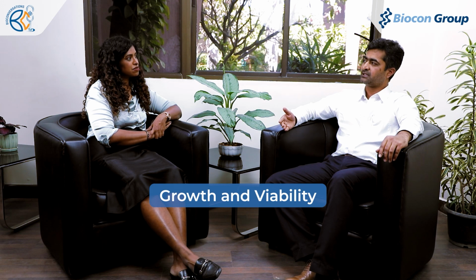And after that, since we have to grow a sufficient number of cells, during that time, growth and viability is something which we'll have to monitor and carefully see, and sometimes there will be issues relating to that. And once prepared, the characterization is extensive. So most of the testing will also be outsourced to third parties, wherein proprietary methodologies are employed. And that is where we will not have access to everything because they are proprietary. So in this way, access to this information becomes important.